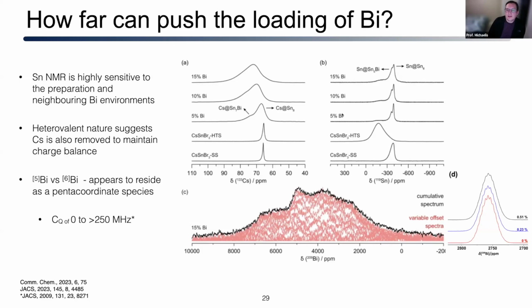So in terms of the methyl ammonium tin iodide rotor and the fast degradation, yeah. This is probably the only time that I've run a sample that would not be stable during the experiment. The rotor was run under a closed nitrogen environment.